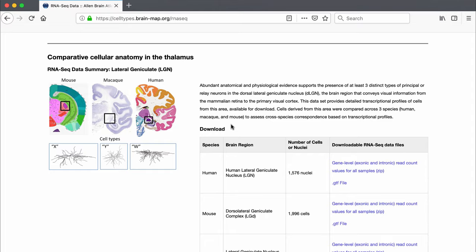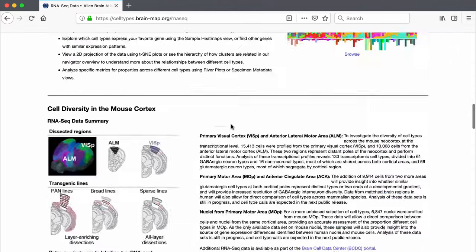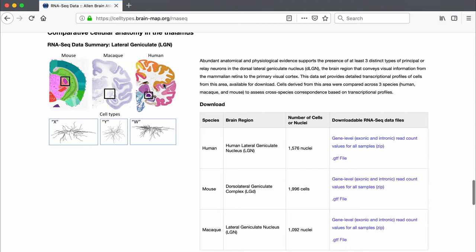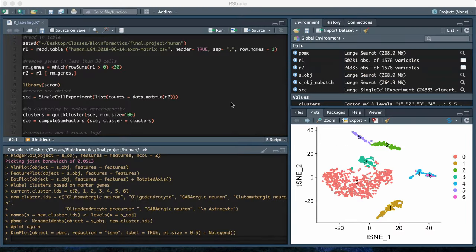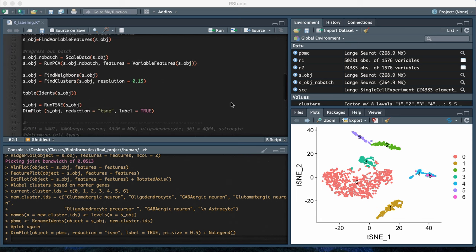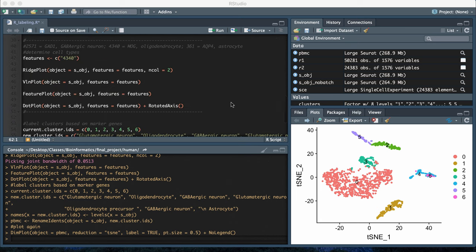I'm using this publicly available data set from the Allen Institute, and in particular I'm using some thalamic nuclei from the human. I have nuclei from the human lateral geniculate nucleus. I'm looking at neuronal cell types, and I want to be able to label the different cell types from this thalamic nuclei.